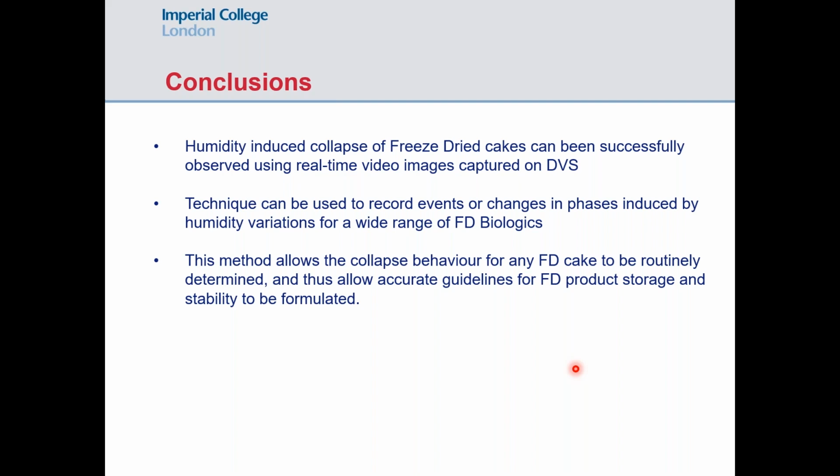So the ones we saw today were about 1 meter squared per gram. Nitrogen can do those, slightly high errors, but when they get smaller than that, the advantage of the IGC method become more substantial. I thank you for your time and attention, and happy to answer any questions you might have.